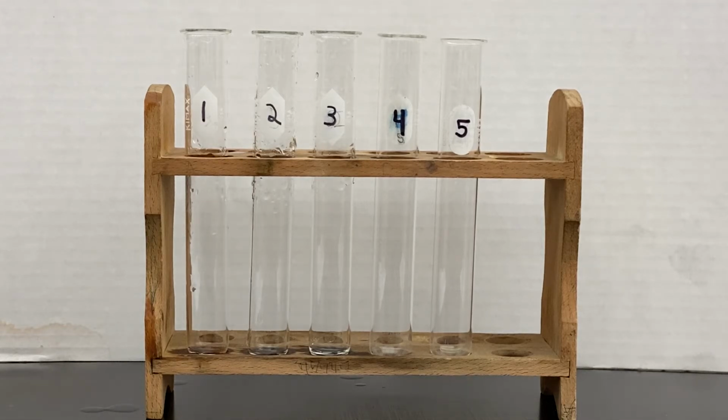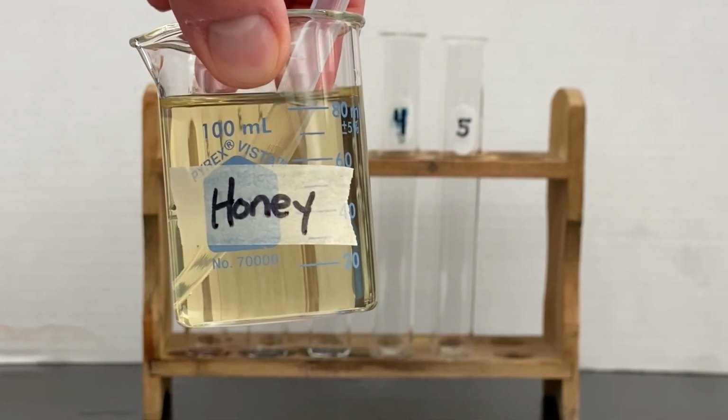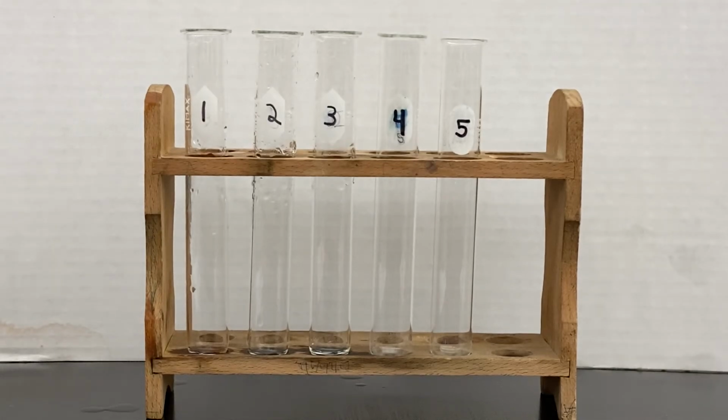So in the first test tube, I'm going to take a very dilute honey solution, and I'm going to put 20 drops of that honey solution in the first test tube.